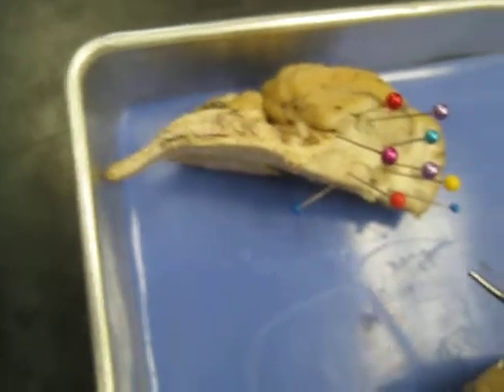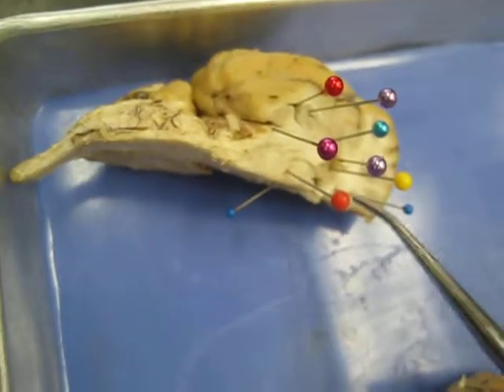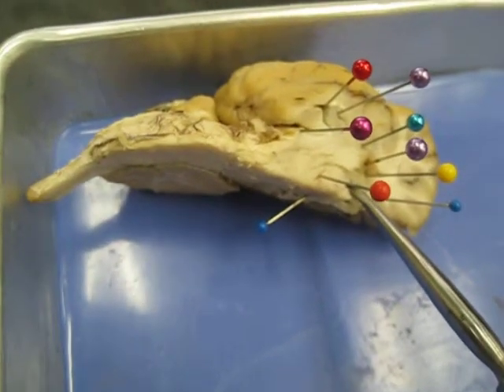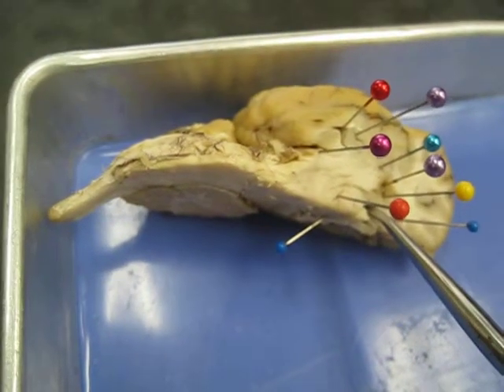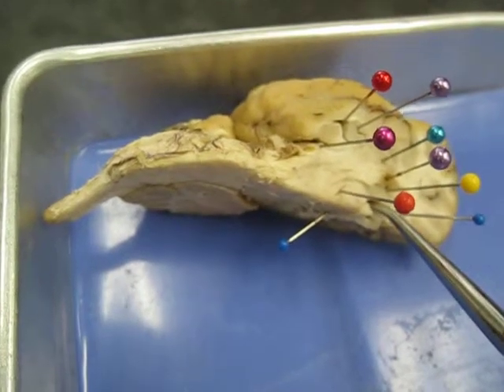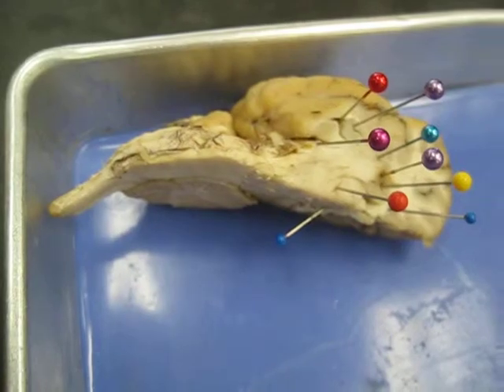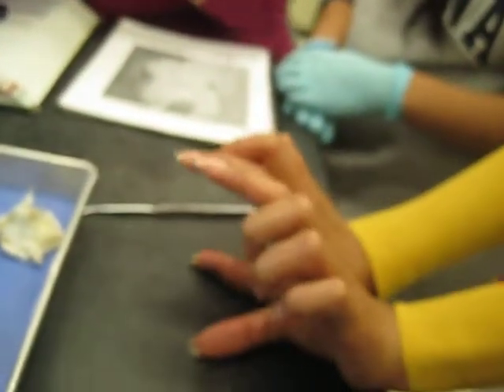So you have, what was this? What's this space, right here? Is that your lateral ventricle? Yeah, that's your lateral ventricle. But remember I was saying that the lateral ventricle is shaped weird. It's like a horn or like 2 C's, kind of like this, coming at you. So what this cut is, it's cutting your lateral ventricle like this.